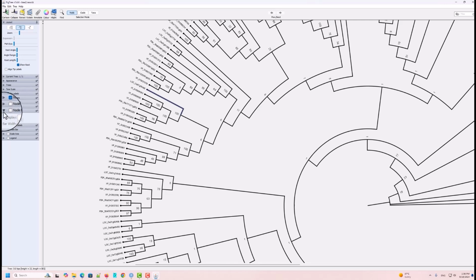Okay, and this is the branch label. The branch label is the branch length. You can see here these digits appear in this one. So these are the branch label, but for the branch time, here you can see the branch length. Okay, so here we can keep the branch length. For the time being, we will uncheck this one. Okay, so we only want to show the bootstrap value and different clades. Okay, so now we will zoom out this tree.